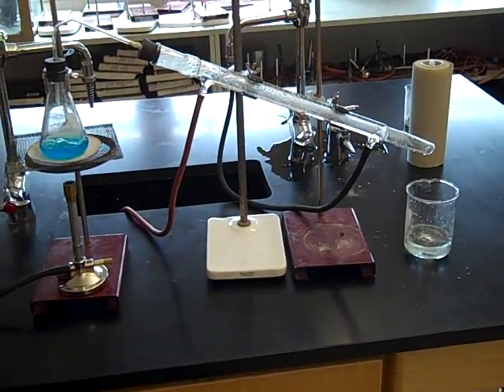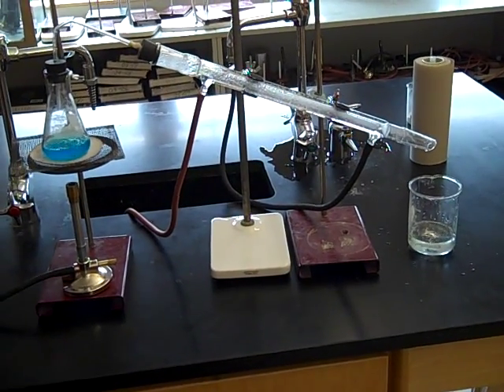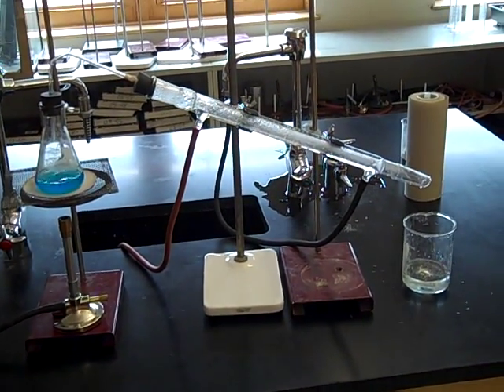That's a distillation. That's one way you can separate homogeneous mixtures. It's varying boiling points.